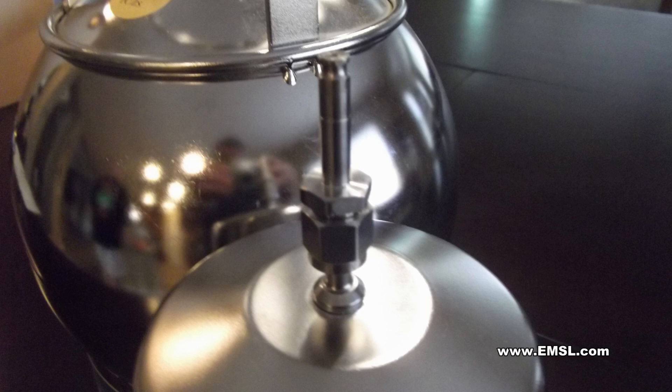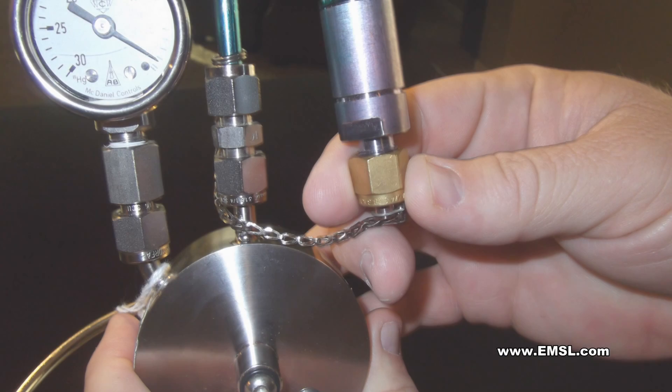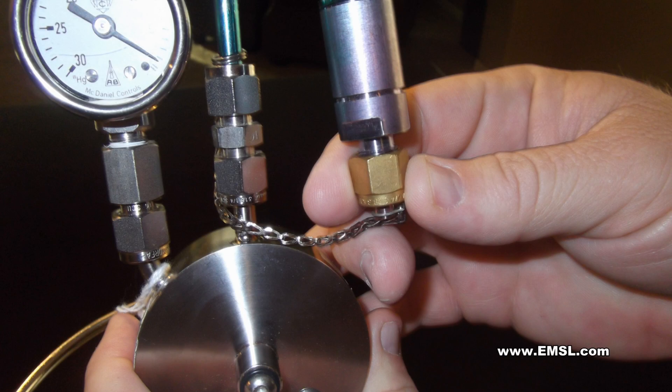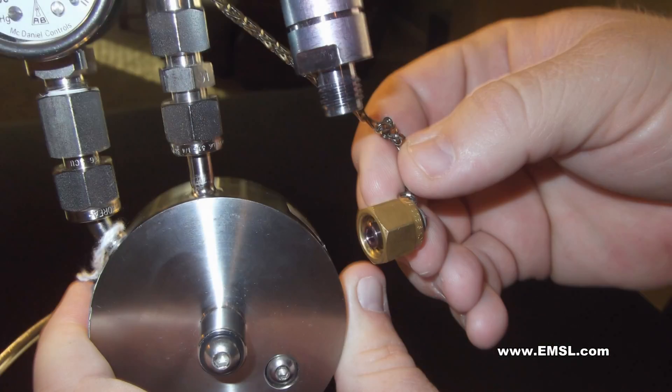Before attaching the can to the regulator, loosen the brass cap attached to the chain on the end of the regulator, if present, and let it dangle.